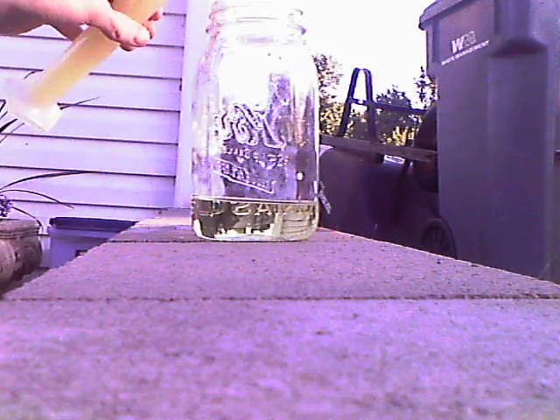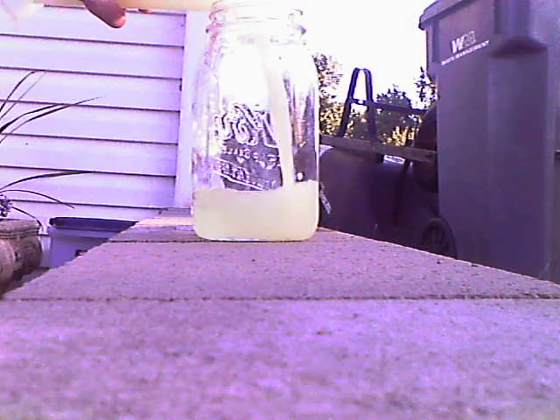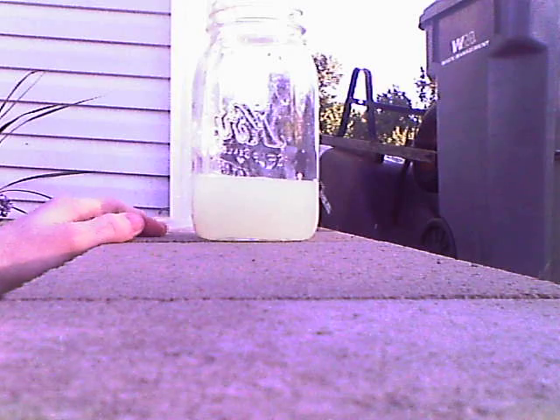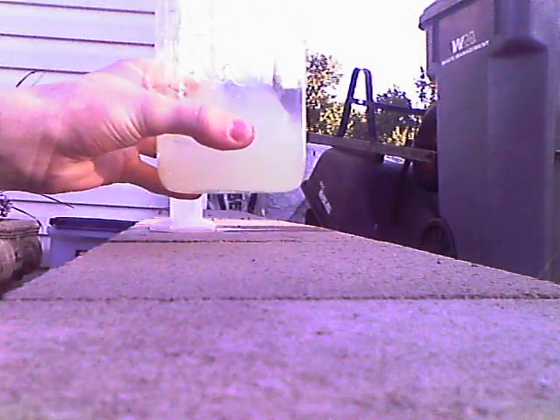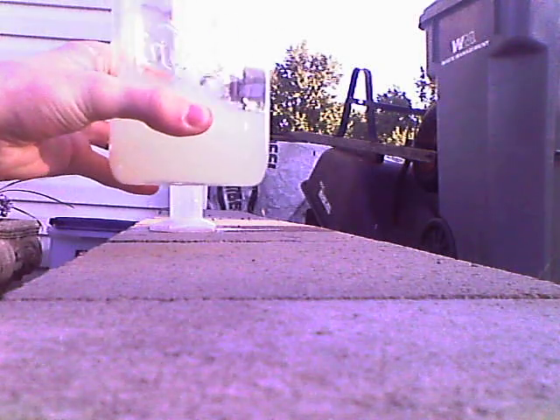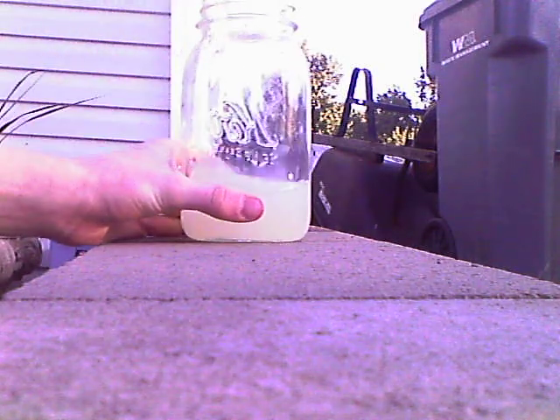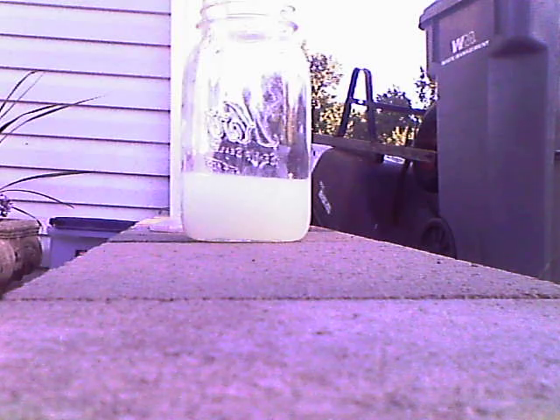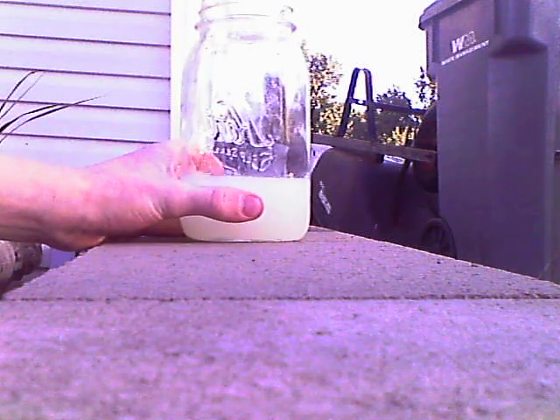As we pour in the citric acid, it will cloud up a little bit and it will slowly turn white. After a couple minutes, it will begin to get hot. It's starting to get hot now — you can feel it's hot.